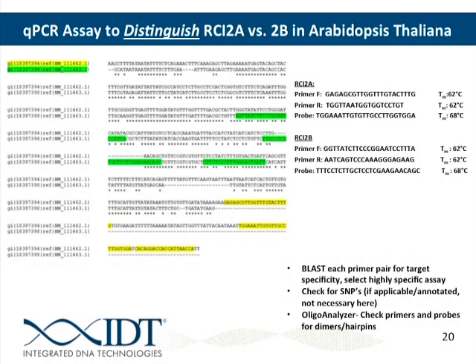And so in doing so, this region here I highlighted as a potential good place to try. A lot of this is going to be trial and error. You're going to see an area that looks like it would be good to design to, and then start to design to it and need to change things up. So it's a lot of looking through, finding good areas, trying a design there, and then moving to a different location if you need to.